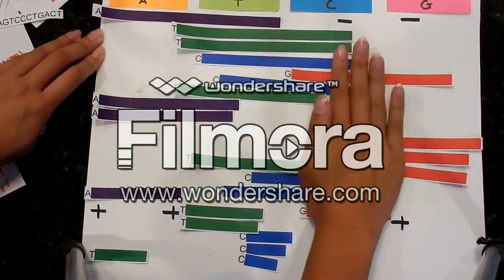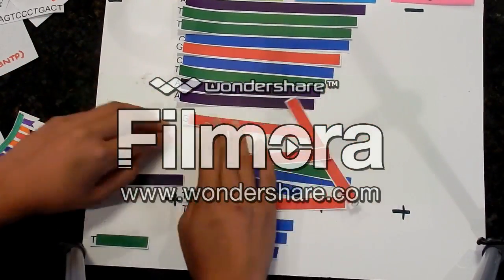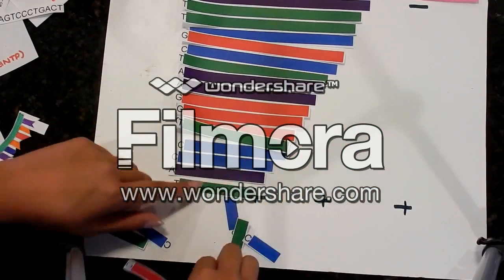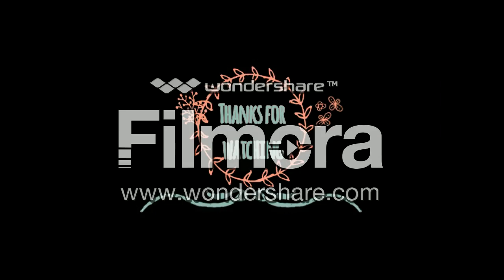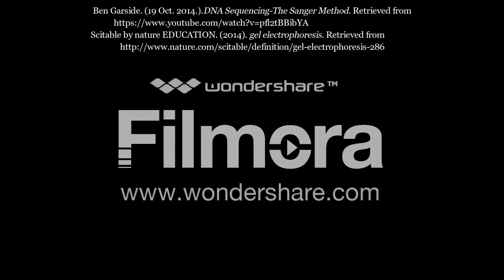Okay, so here we have the finished gel electrophoresis test, and each lane has the different fragments of DNA in a specific order. So we can start merging each lane together depending on its order, so we can identify the sequence of the DNA nucleotides. And once we're done putting all the lanes together, it'll create the specific sequence we had at the beginning. So we have correctly identified the DNA nucleotides.